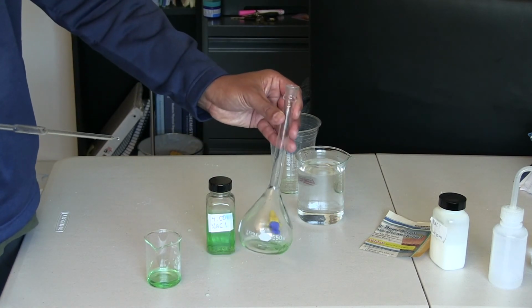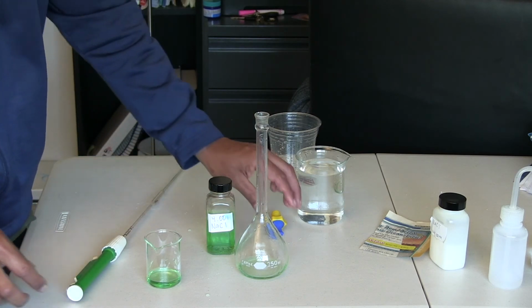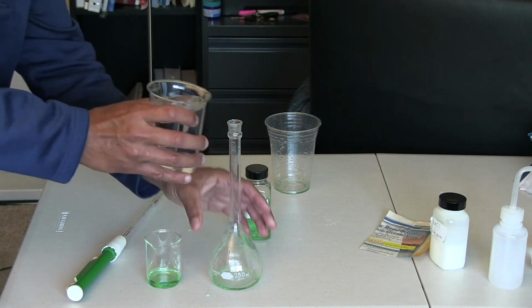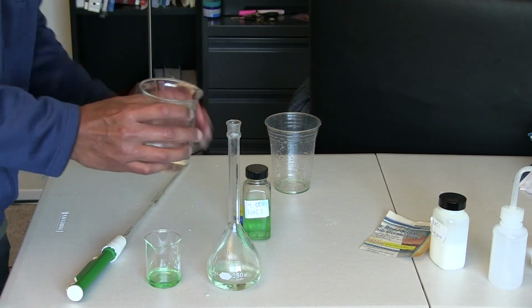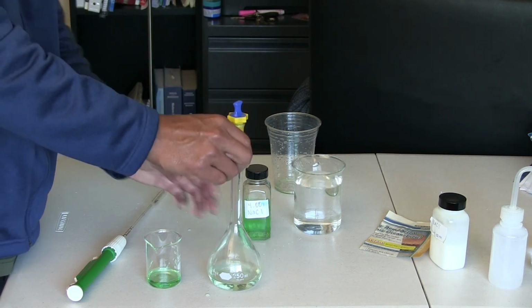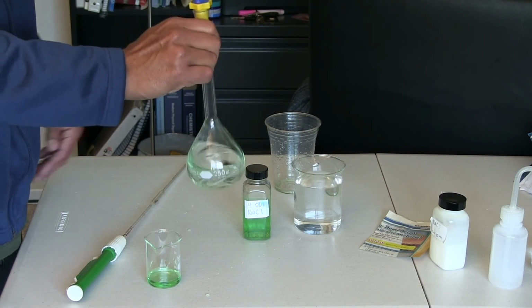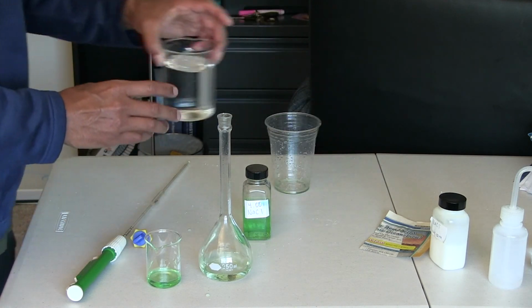Okay, so I transferred the amount that you guys calculated. Let's assume that. And the next thing we want to do now is add some distilled water. So next, we're going to do this. We want to make sure everything is dissolved. And now we can fill it up with some distilled water.